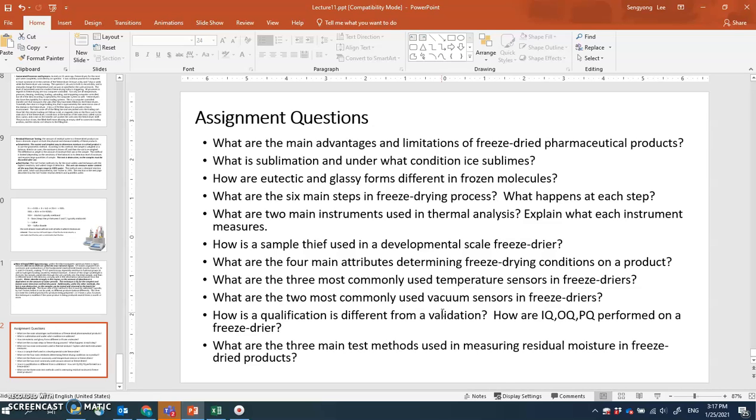That's the operational qualification. And finally, performance qualification is normally done after what? After maybe replacement of a part, to see if that replaced part is functioning correctly.